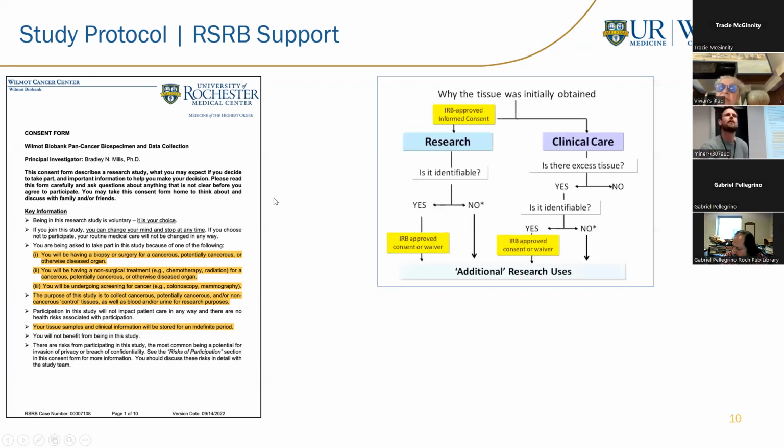Yeah. So you have brought in this plasma or serum, and also do you collect urine? Yes. So yeah, I didn't mention it. Urine is on here, and we're constantly amending this protocol, and we're beginning stool collections as well. So urine and stool are both on there. And the blood, you collect the serum or plasma? Yes. Both? Yeah.